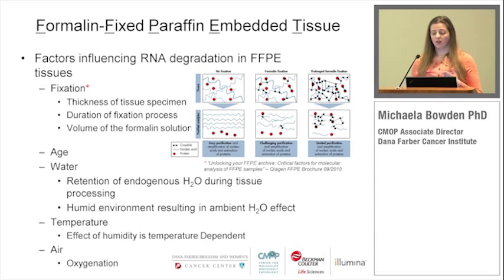And so historically, as I said, FFPE tissues have primarily been used for diagnosis or for protein marker-based IHC stains. So nobody ever thought to save them at 4 degrees. Even if you process a block quickly and put it at 4 degrees, it will preserve the RNA and DNA far better. But obviously these things have been collected for 50 years, and nobody at that time had the foresight to think this is possibly something we should do.